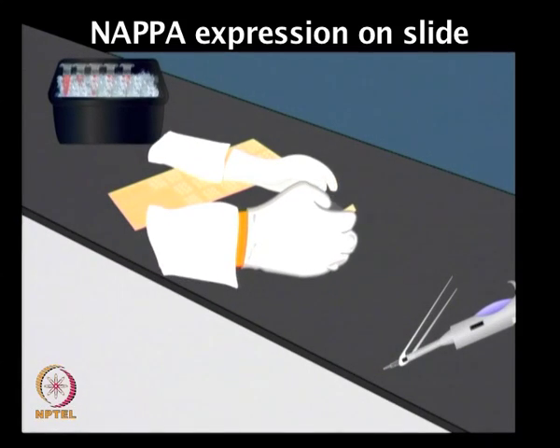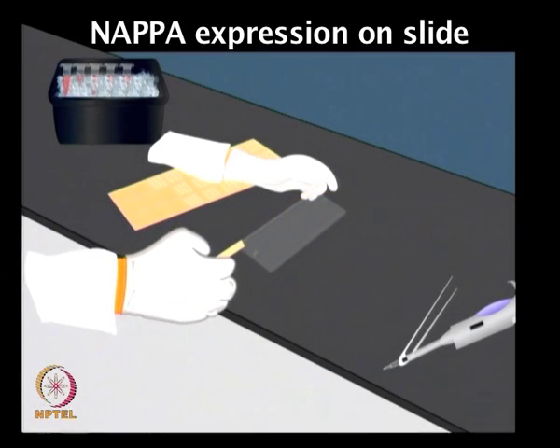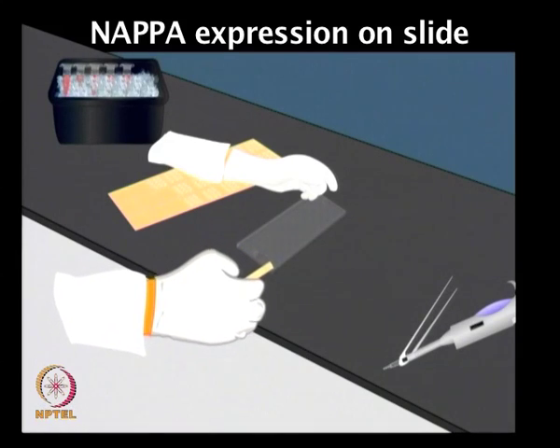So, let us first look at the NAPPA expression on the slide, and then I will describe scanning for both DNA printing and the protein expression at the same time.